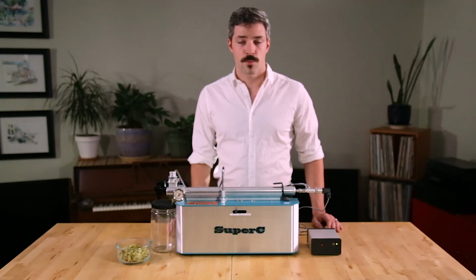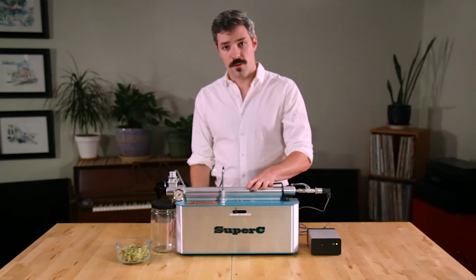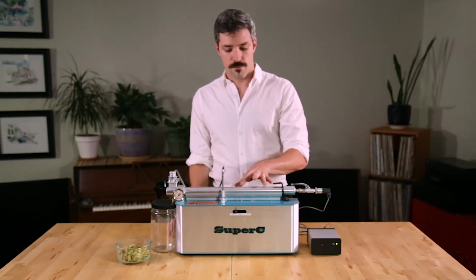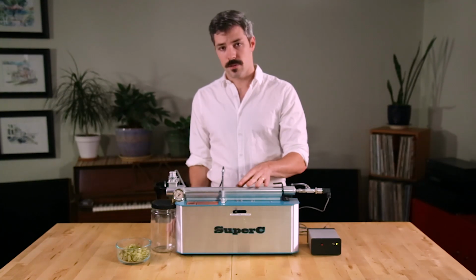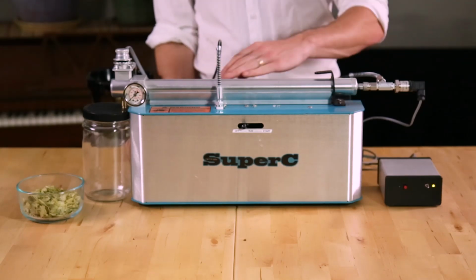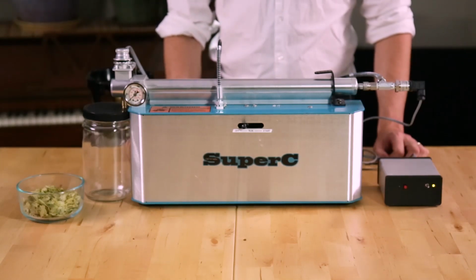Once our material is prepped, we can load the chamber. I've already loaded this chamber, and what I did was I took my ground material, working in sections, filling, and then packing. We want an even and firmly packed bed of material so that as the CO2 flows through the system, it's contacting as much surface area as possible.